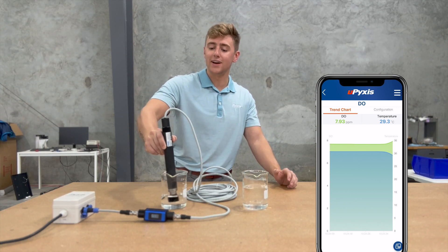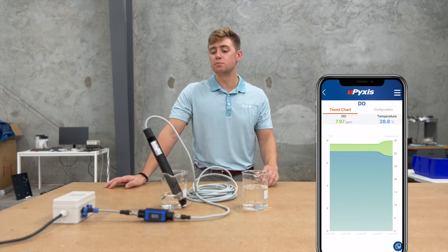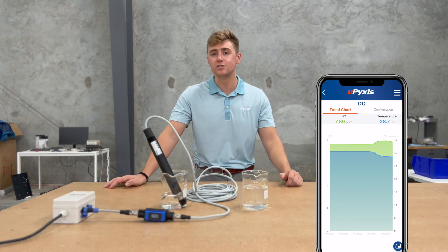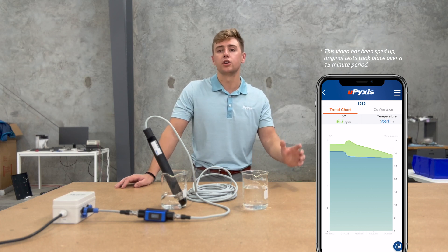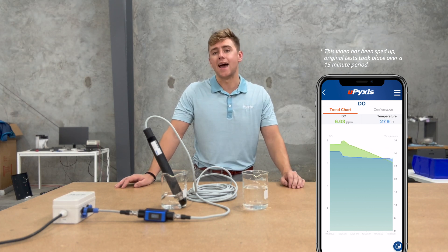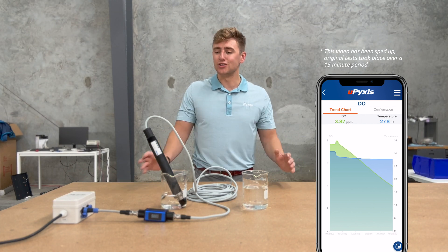The sulfite is there to try to eradicate some of the dissolved oxygen. You can see on youPyxis when I place the 772 into the sulfite water that the residual dissolved oxygen goes down and measures around three and a half ppm, instead of the 8 ppm we see for regular tap water.